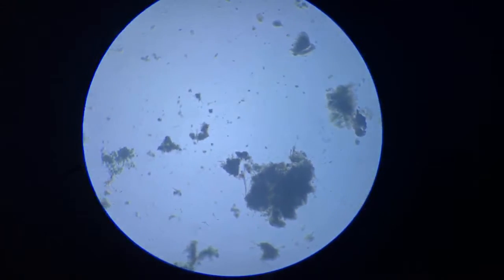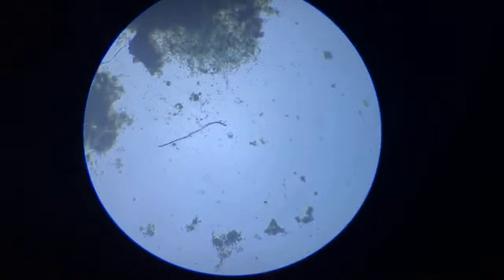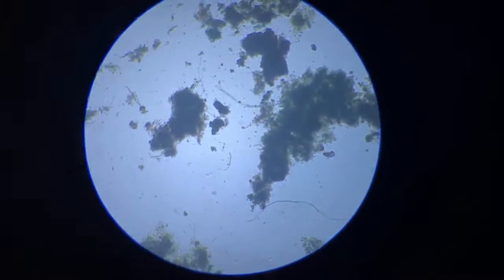Nothing. We don't find any clue of any worm at this 40x magnification, but the moment I turn to 80 to 100x, things would change, and we'll find some worms here and there. Even at 100x, they are very difficult to see.